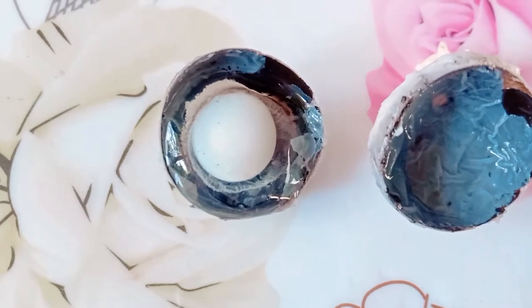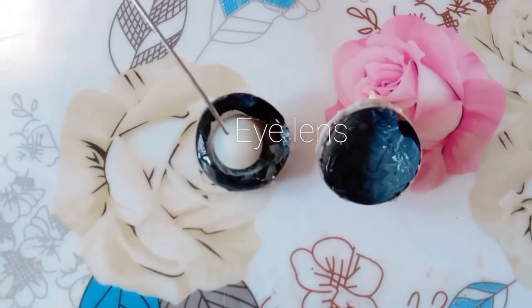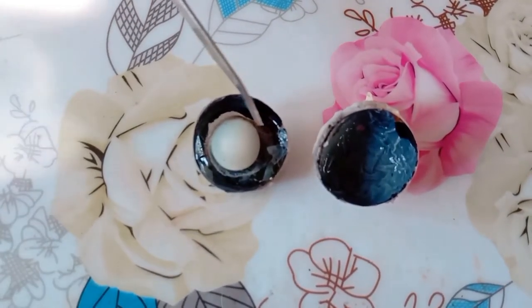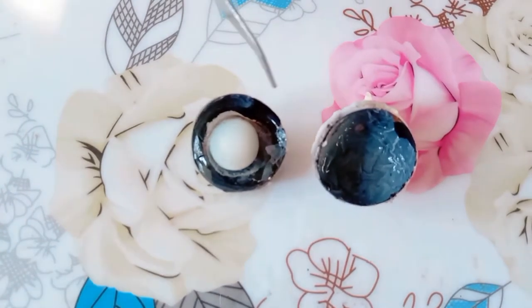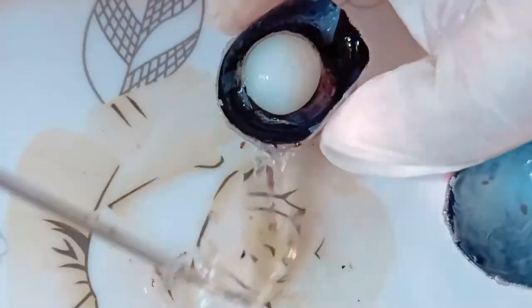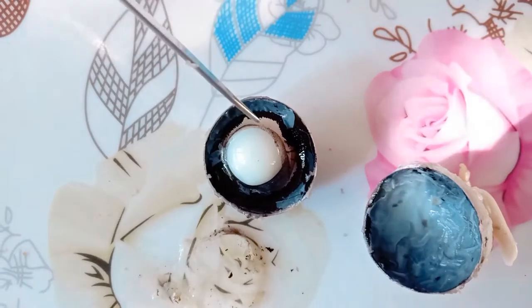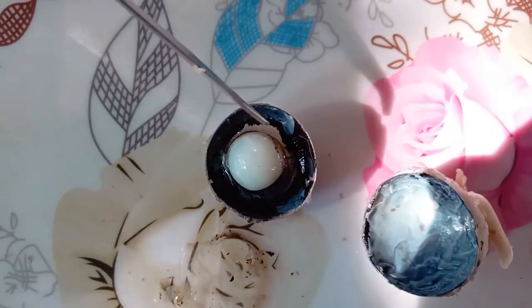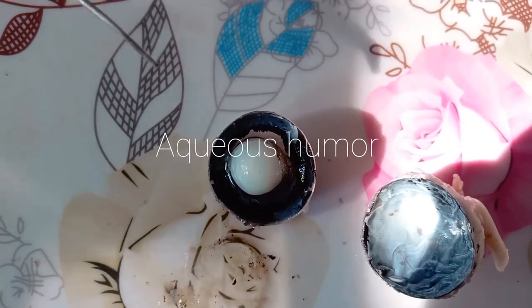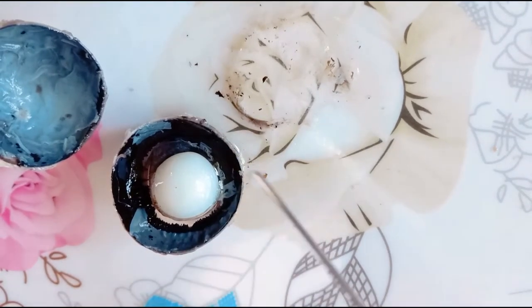The inner eye is divided into two parts. This is the eye lens, and the part behind the lens is a fluid liquid — this liquid is called vitreous humor. The part in front of the lens is also filled with liquid; this liquid is called aqueous humor.